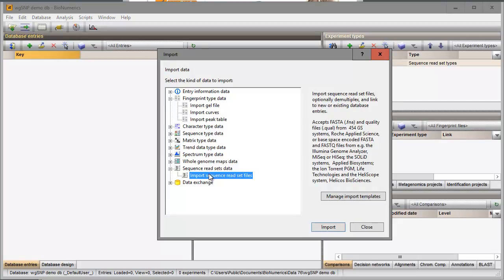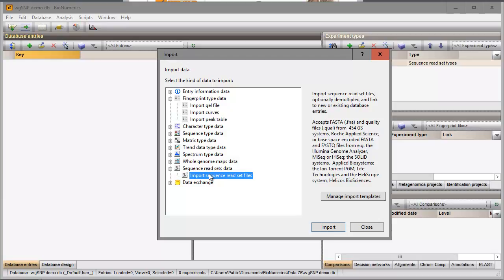With the option Import Sequence Read Set Files, sequence reads can be imported and stored inside the relational database. Sequence reads can also be imported as data links in Binumerics, but this requires the installation of the Whole Genome Sequence Tools plugin in the database.